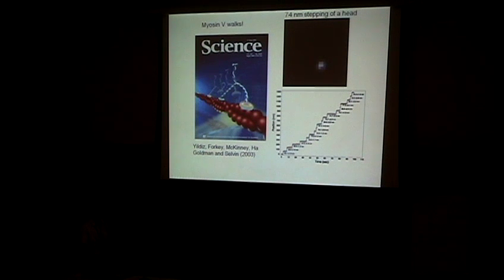You can actually see it in this movie I show you. Because the pixel size is 80 nanometers, it moves by almost a pixel, but in the diagonal direction, in this direction. So you can actually watch the movie and then analyze the data, fit the data using your brain, and then determine the steps. There was a step. And there was a step.